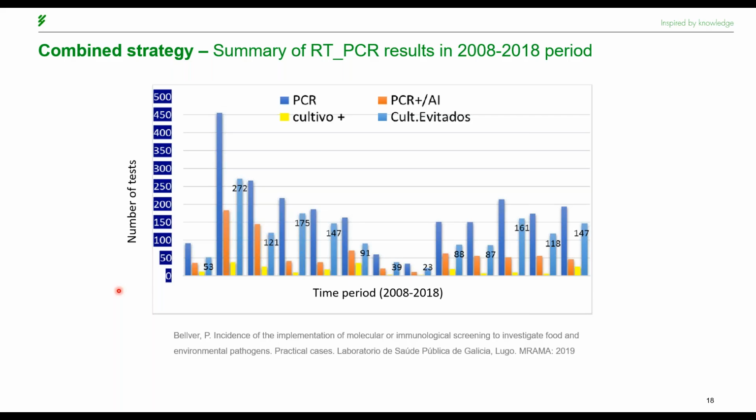Besides all the lab work, because the antibiotics are included in the media, the disposal is also quite difficult. So with this joint strategy, a huge load could be avoided. It gives us versatility and, most importantly, speed of response to emergency situations.